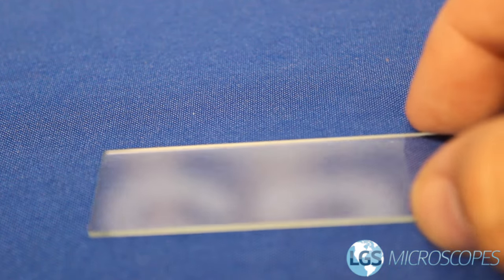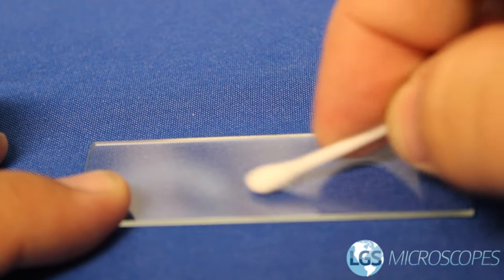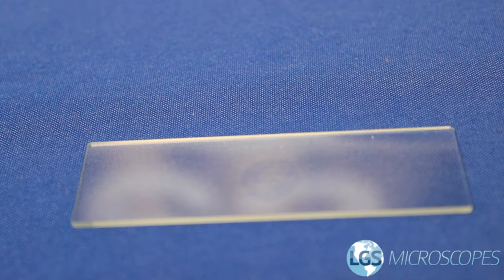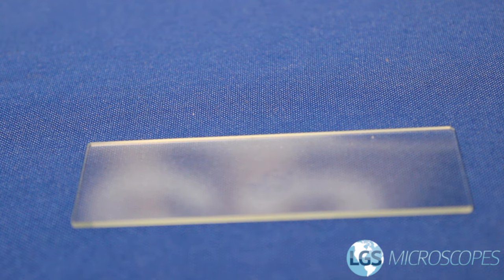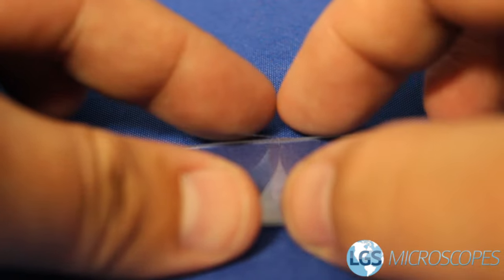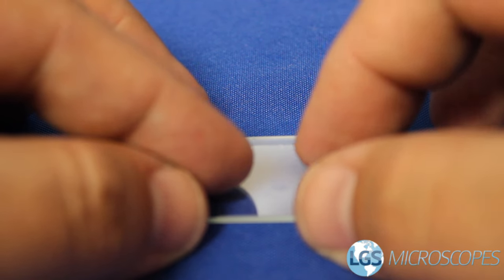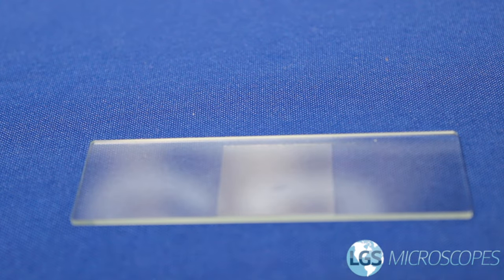When you're preparing your slide you're going to need your slide, whatever your sample is, and then a very important part if you're going to use immersion oil is you need to use a cover slip and just place that right over. This is so that you don't get any stain or any of your sample onto the objective lenses.